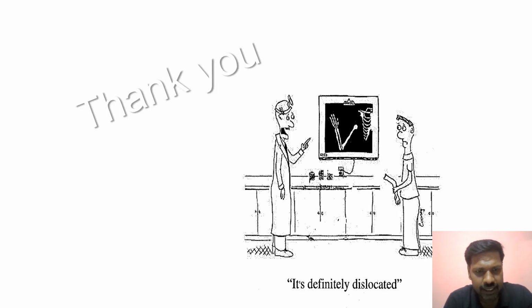To summarize today's lecture, XRD is a powerful tool for studying crystalline material. It is based on X-ray diffraction and Bragg's law. It provides information about structure, phase, and size. Powder XRD is especially important for nanomaterials.